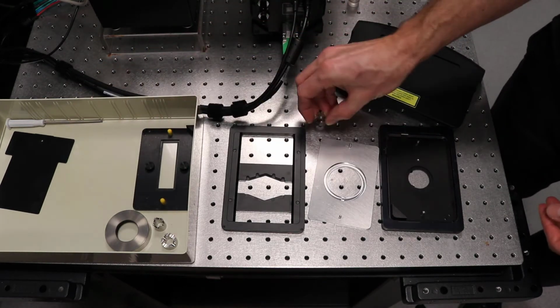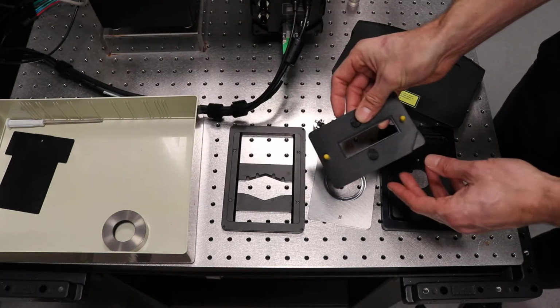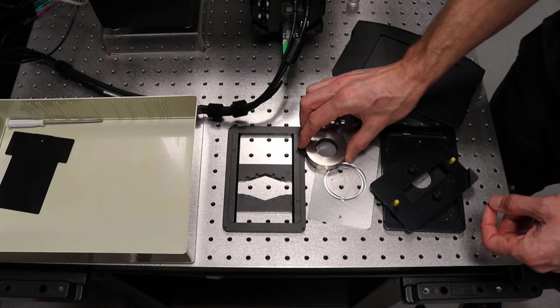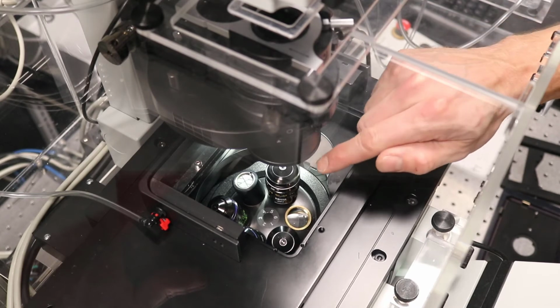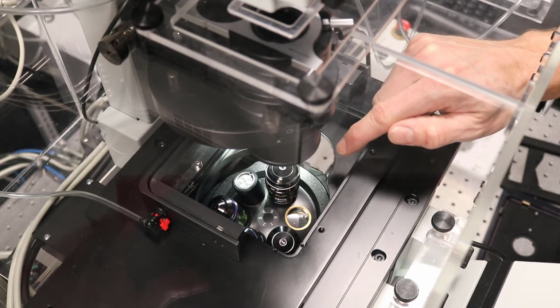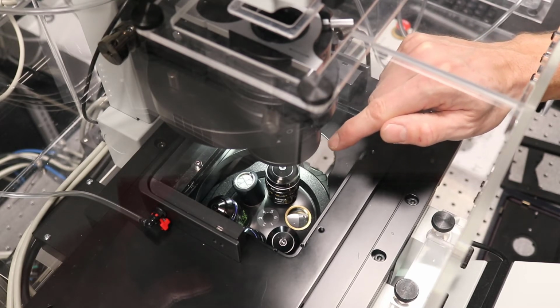The remaining parts are some custom devices made for calcium imaging, and then there's also a special insert for some EVD slides, and a weight you can put on top of your dishes to put on pressure and have even imaging. So in the image now you see a special lens for TIRF. This is a 150x objective lens with an NA of 1.45. And I have to emphasize that this is what you need to take care of.